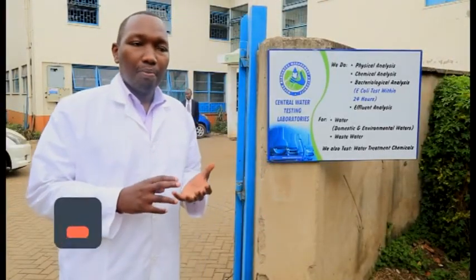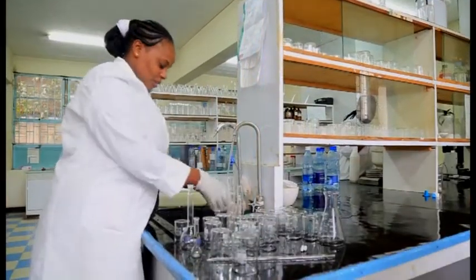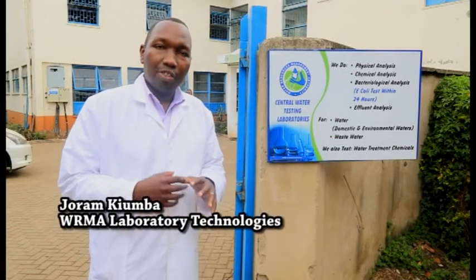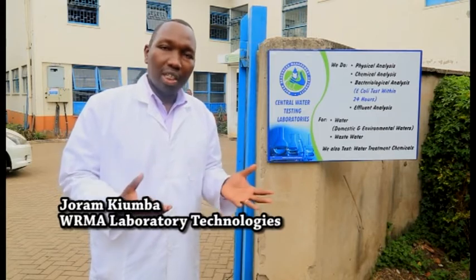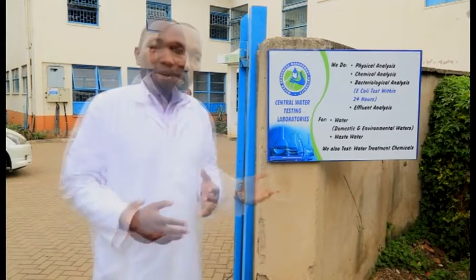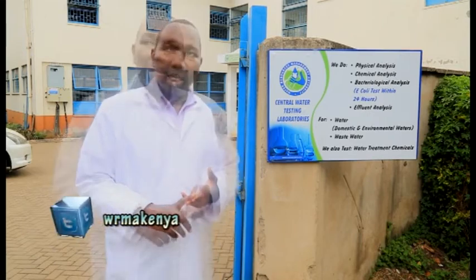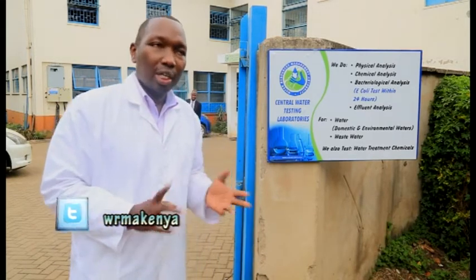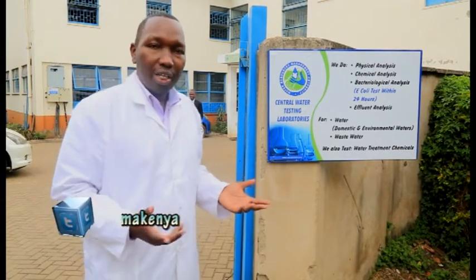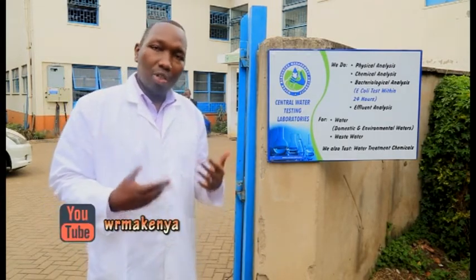And we do drinking water tests. Under drinking water tests, we do bacteriological tests and potable water tests. Bacteriological tests normally involve testing the microbial content of the water so as to avoid diseases like diarrhea and typhoid. Potable water test involves physical chemical parameters. This includes pH, conductivity, fluoride, arsenic, ammonia, and such like parameters that determine the quality of water.